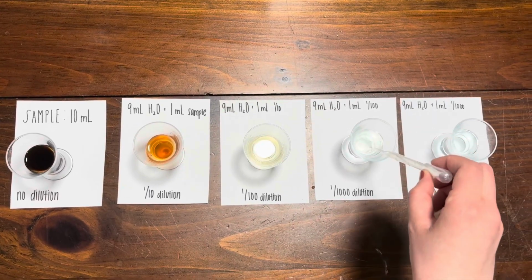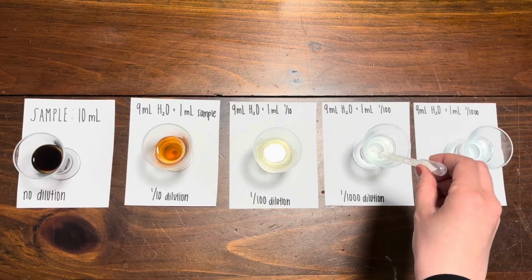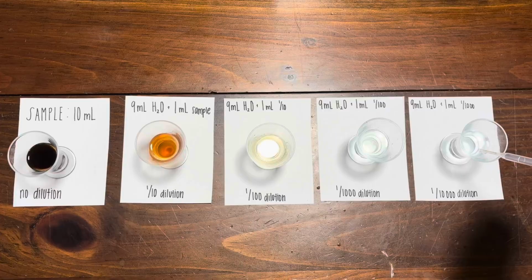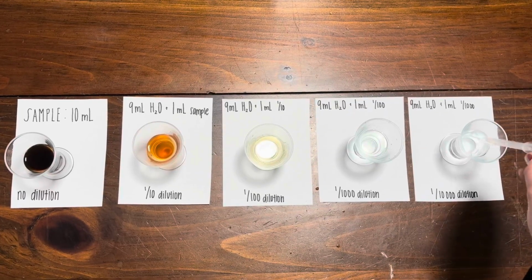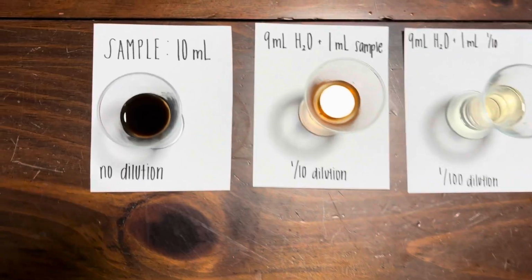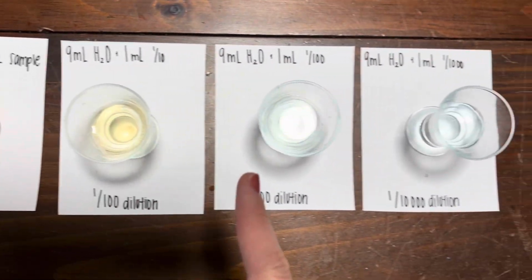Mix it. This represents a 1/1000th dilution. And then 1 milliliter from here into the last one. And that represents a 1 to 10,000th dilution. So you can see the difference in the colors as we get continuously more diluted.